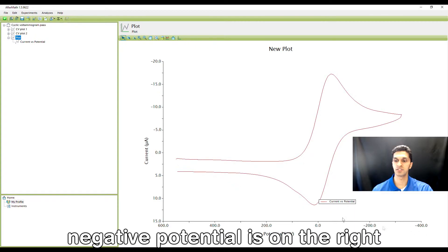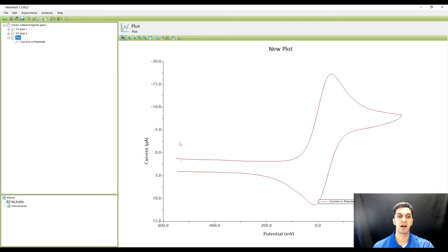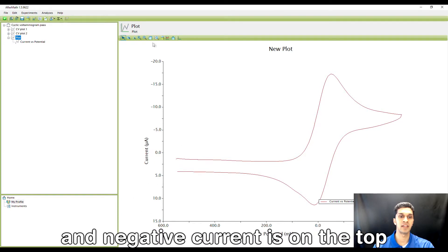Negative potential is on the right, positive potential is on the left, positive current is on the bottom, and negative current is on the top.